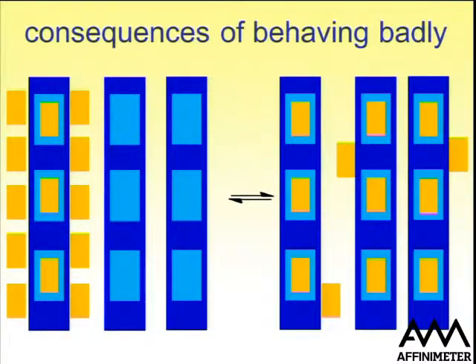The consequence of that for your binding models is that if I now add a second bit of DNA, this is the situation that I had. I had this DNA with all the ligand bound to it. I add 2 more strands. These 2 new strands are not picking up my ligand free from solution. They're actually picking them up from the secondary binding sites on the first bit of DNA. And that means that my equilibrium constant is not picking up the ligand from solution. It is more like an apparent equilibrium constant for competition between different binding sites.